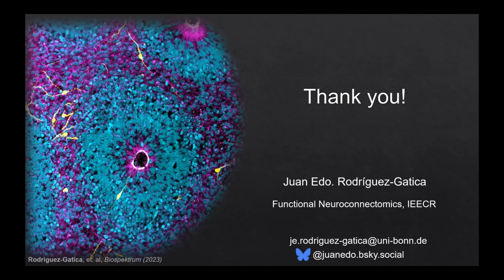We really had problems with, for example, HaloTag when we were working with cultured cells, but then it's also possible to digest, not using proteinase K. We use something different that I don't remember now, but if you want, I can check. HaloTag and proteinase K is not working well, but you can change proteinase K for something else. Thank you.